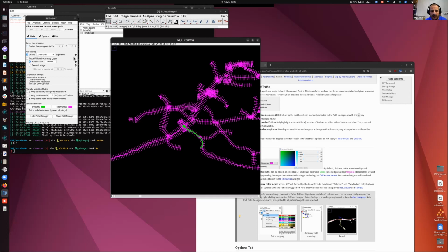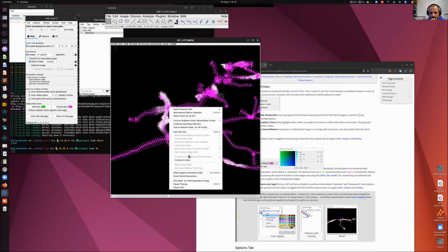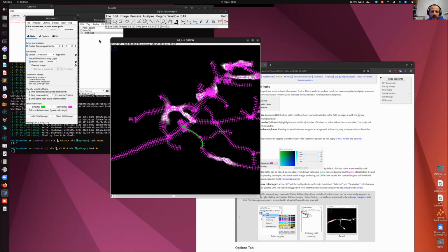You can also have shortcuts to click at brightest locations, which you can find here on this menu. And in a nutshell, that's pretty much it. Other things that are important is the algorithm that is used to find the optimal curvature between start and end point. That's A* search. We have implemented recently another variant of that. We can discuss it in detail.